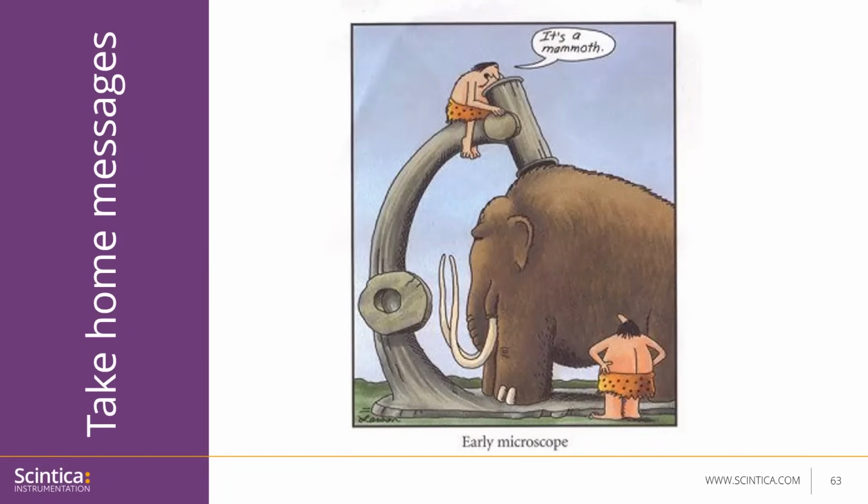I hope I've been able to show you that intravital microscopy, even though based on old technology, has come a really long way in the past decades, especially with the introduction of the confocal and the two-photon microscope. I hope you've also firsthand witnessed how it can be applied in a multitude of different research fields and how it can be of assistance in uncovering very dynamic processes that can answer very complex research questions.